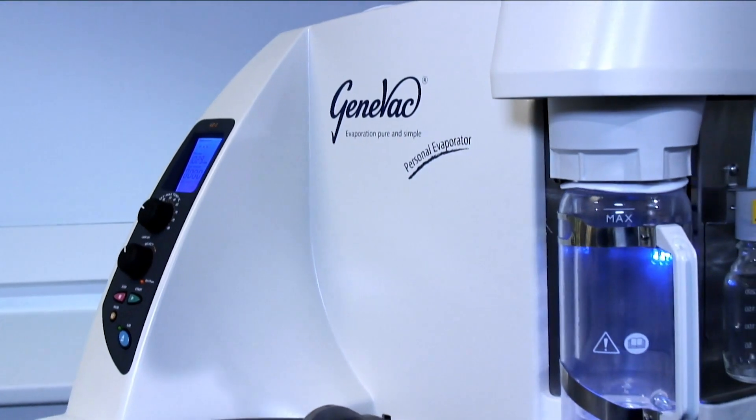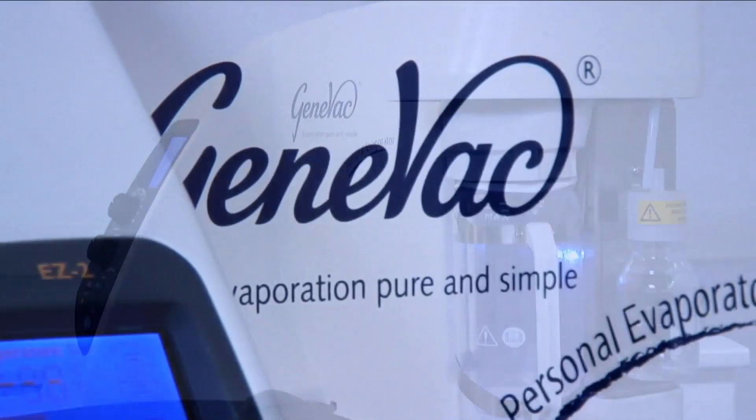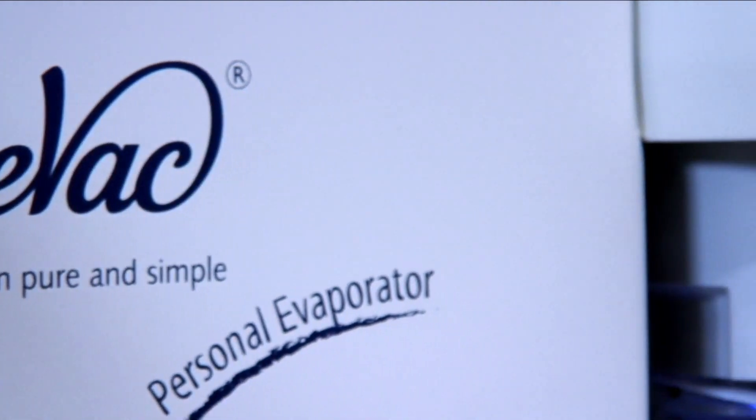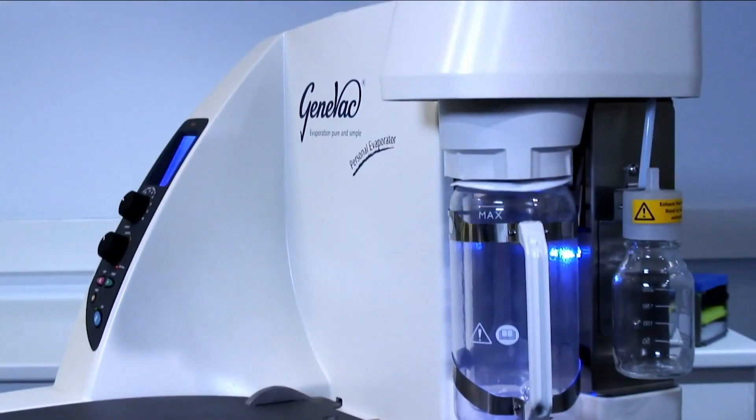The EZ2 is an integrated benchtop solvent evaporator, which may be used to concentrate, dry or lyophilize samples in parallel.